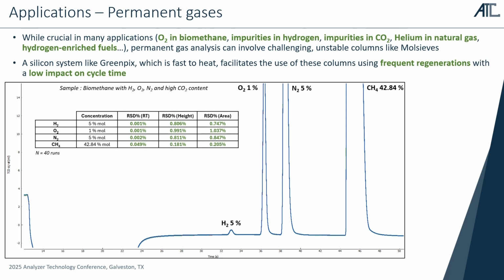It's basically stable with no user interaction at all. This is an important point because it's crucial in many applications: oxygen in biomethane and, what you saw just previously, impurities in hydrogen or carbon capture.